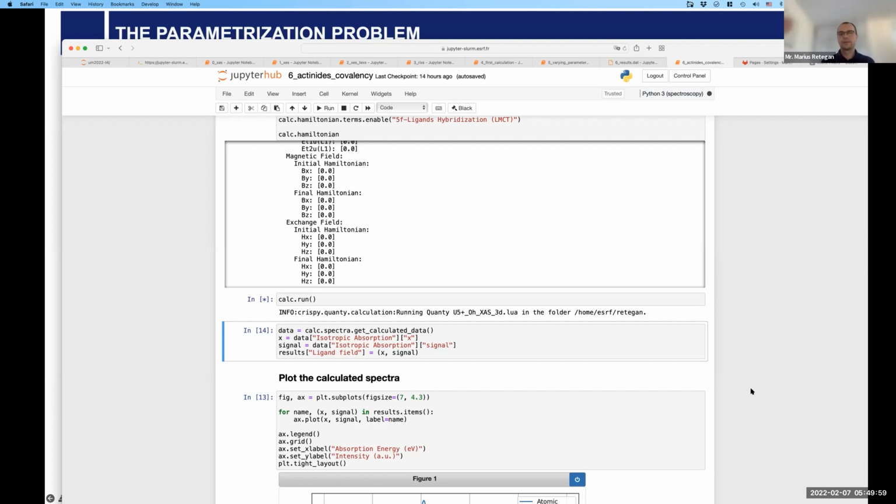That's fine. For data analysis directly at the beamline, I see it as quite useful because it reports essentially what you have done. So this is what I like. It writes like an internal notebook which you can take home and see what you have analyzed. But if you would like to analyze data from other beamlines, from other trips, it will be very difficult to use this type of software because the documentation is, at least from what we have seen, not really there.